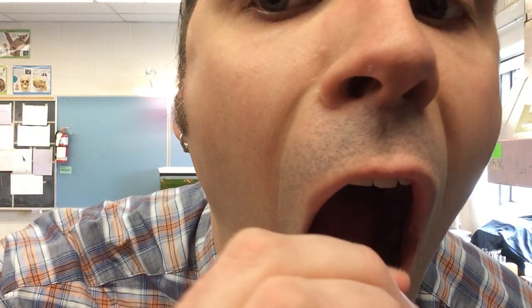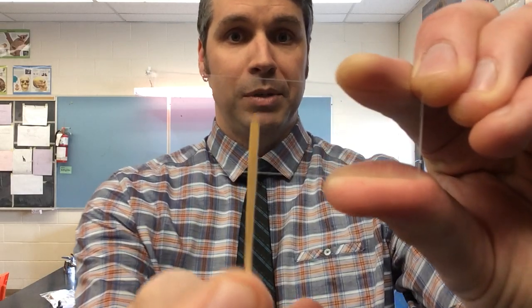First thing we're going to do is carefully scrape the inside of your mouth. So now you have some cheek cells on that toothpick. You're going to put them on your slide and gently smear them in the middle.